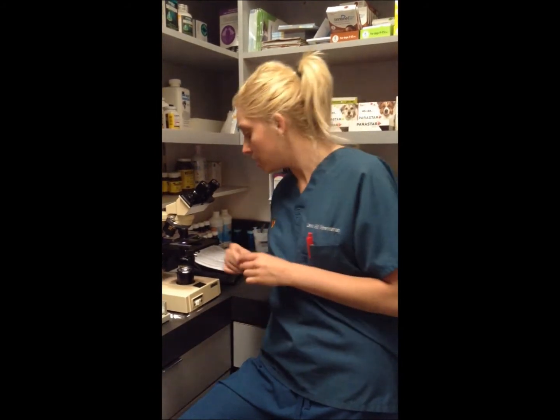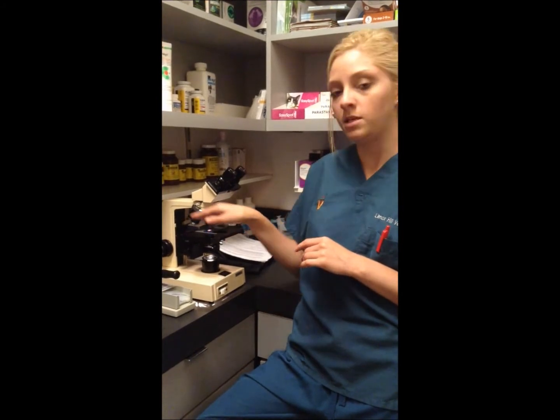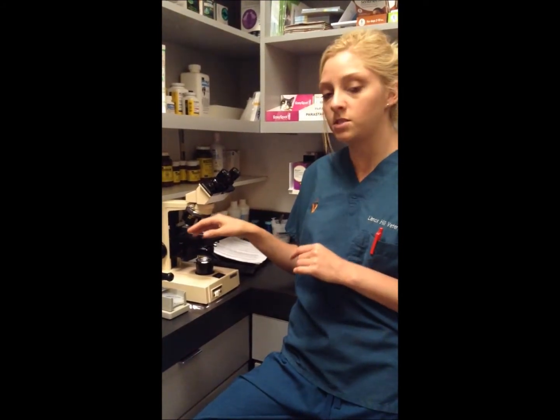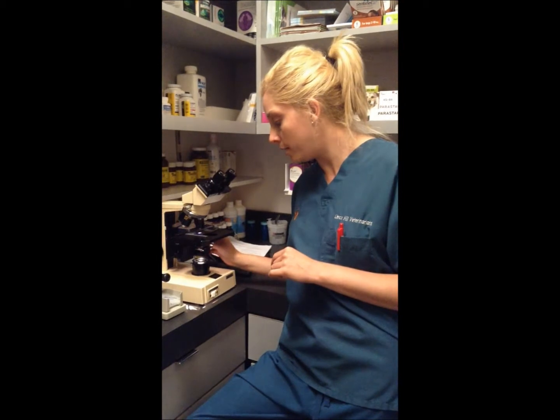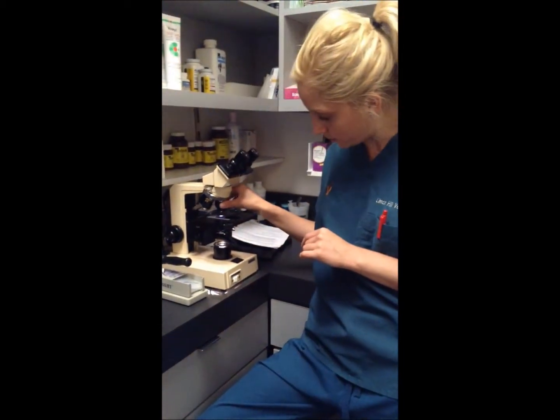Okay, good. We're gonna evaluate our slide now. Basically what you're looking for is bacteria or yeast. Bacteria are little circles and the yeast are little peanut-shaped structures. So you always start in the lowest power, which is the 4x power, and make your way up. You'll be looking at the results in the oil immersion power. You want to make sure you focus in each power before you move up.